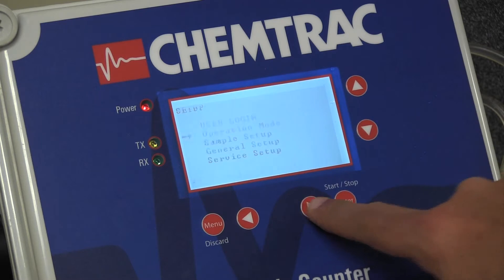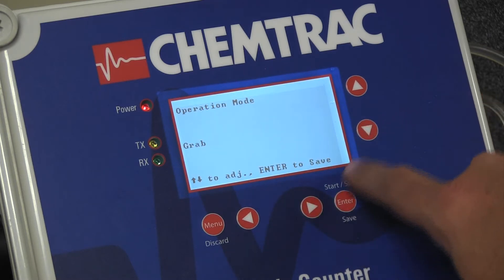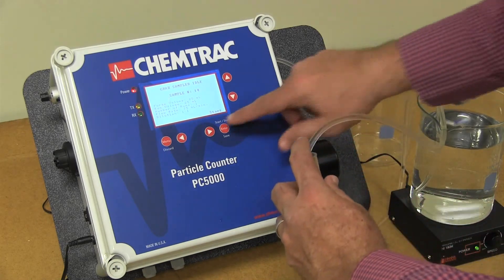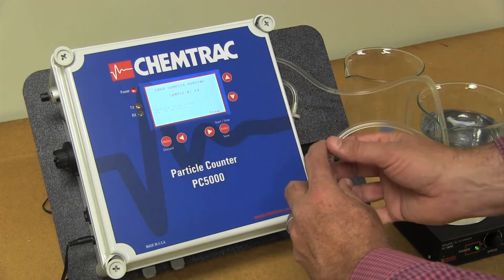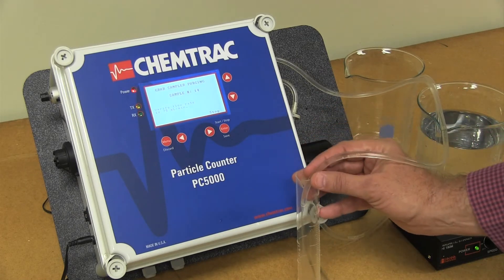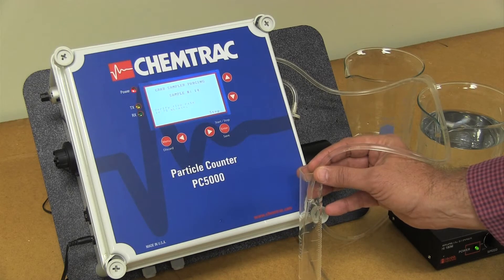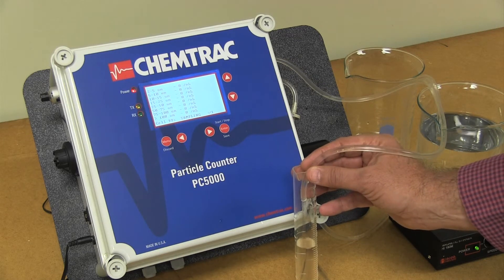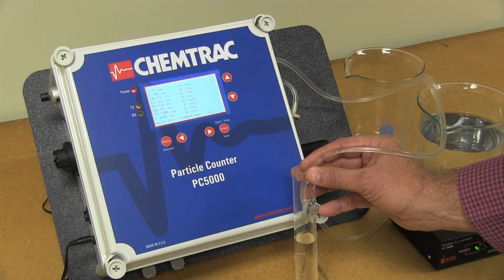The operation mode should be set to grab. The pump volume should be checked in order to provide for measurement accuracy. The purge mode allows for any air to be cleared from the line prior to measuring in the sample run mode. In this case, it is set for a 25 mL purge and a single 25 mL sample run.